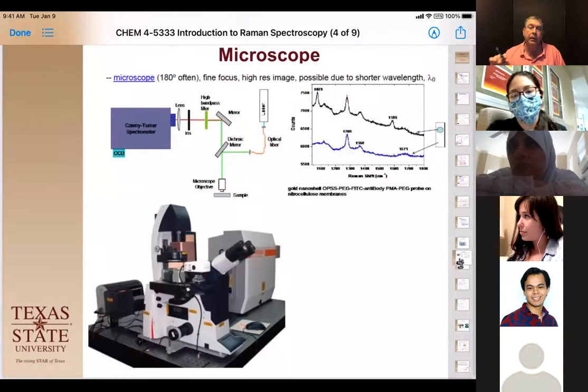It's also good for inhomogeneous materials. Let's say you had a rock and it had different regions in it. You could take it on this and go, oh, look, this is the feldspar, this is the quartz, this is the chert or whatever. And so you can determine the different chemical compositions within a granite, let's say, because you can focus in on each individual section.